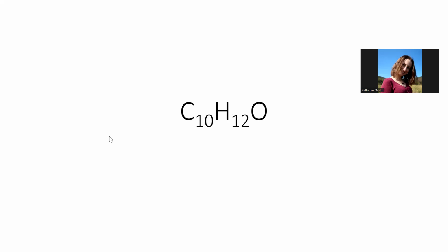All right. Hello, everyone. Today we will be figuring out what the structure is of this mysterious organic molecule. We have been given the molecular formula. It is C10H12O.